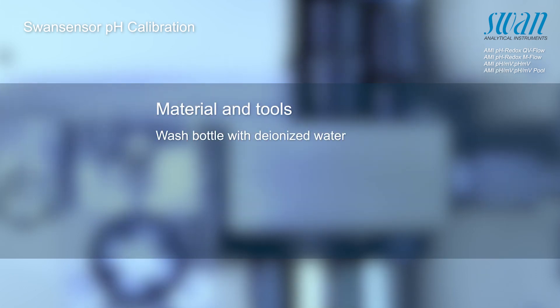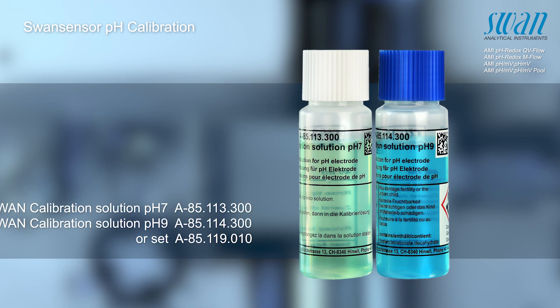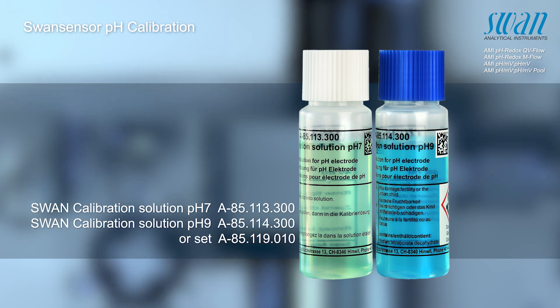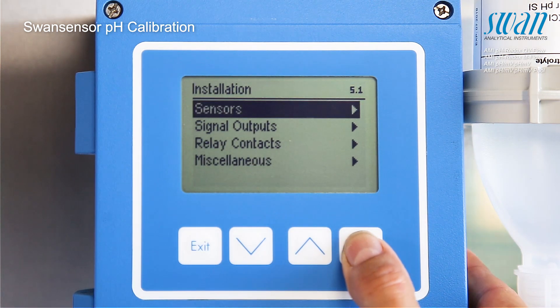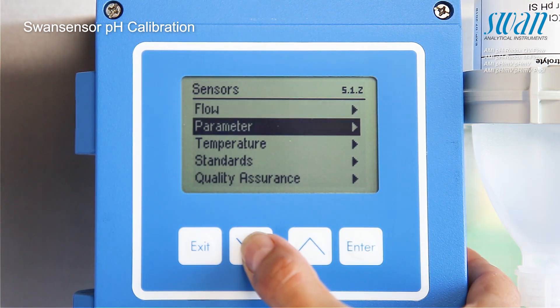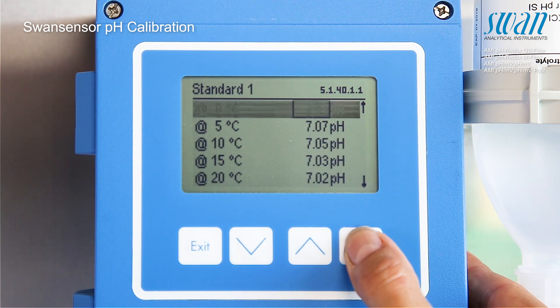The following components need to be prepared before getting started. Two standard calibration solutions are necessary to perform the calibration. Swan's standard pH solution pH 7 and pH 9 are preset with the temperature compensation table. In case different solutions are used, these values can be modified.